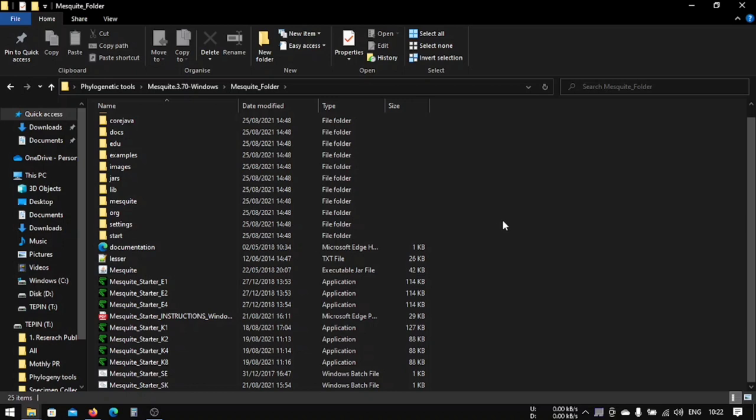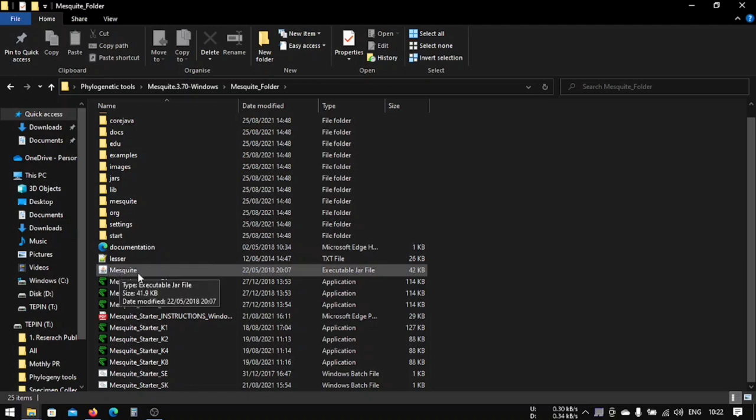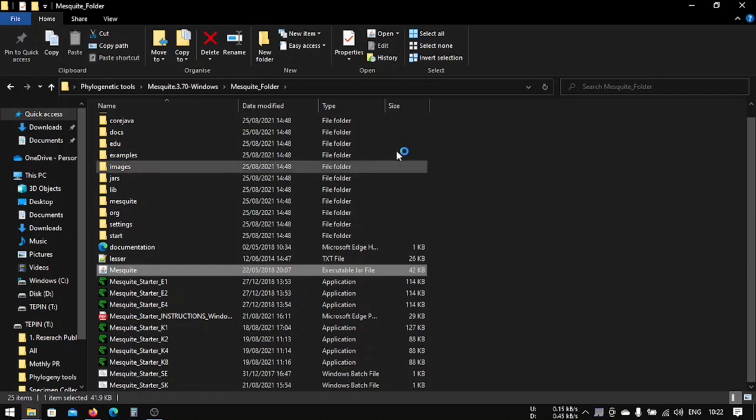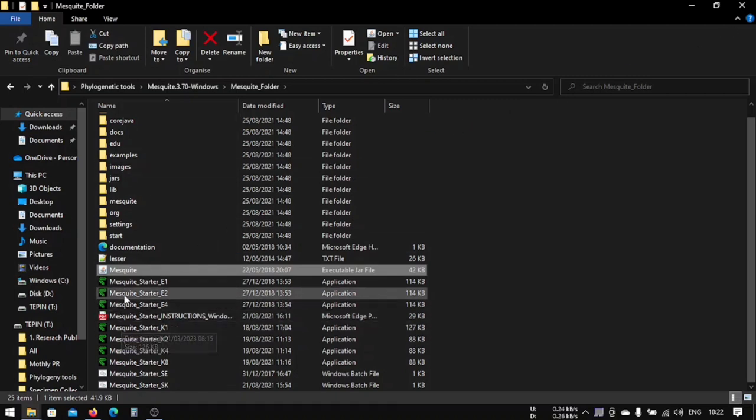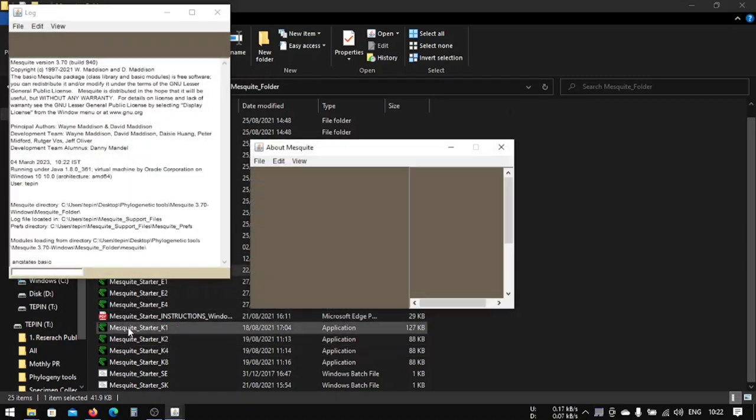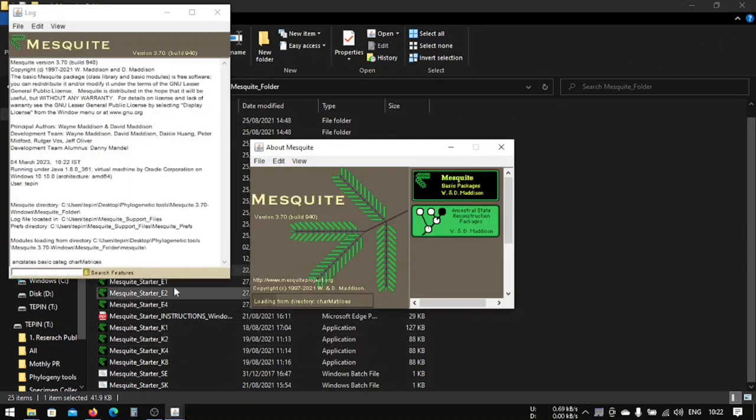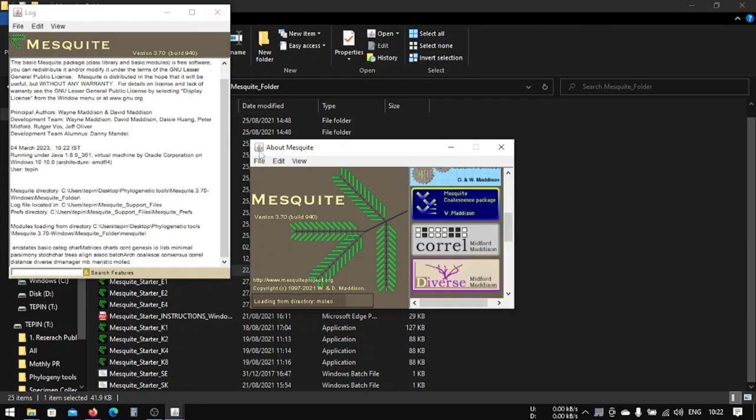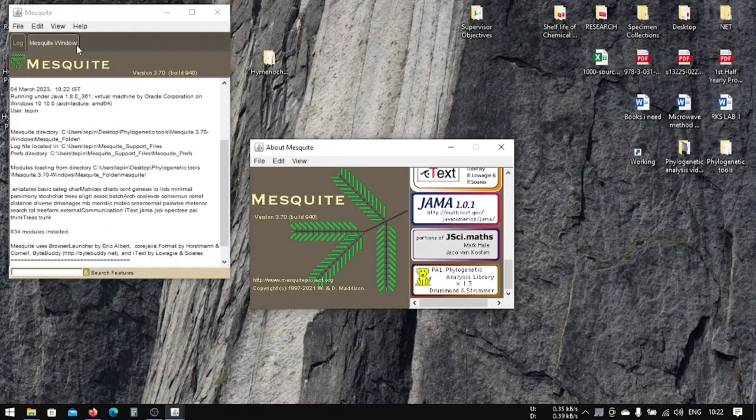If you already have installed Java in your previous JModelTest, if you didn't use it, also install it now because Mesquite will also use Java. We will click in here. You can click also this green one, it won't matter. Just click it and it will open this software.